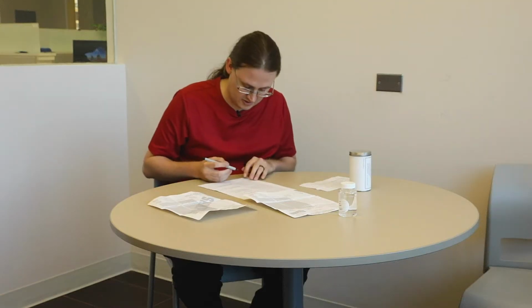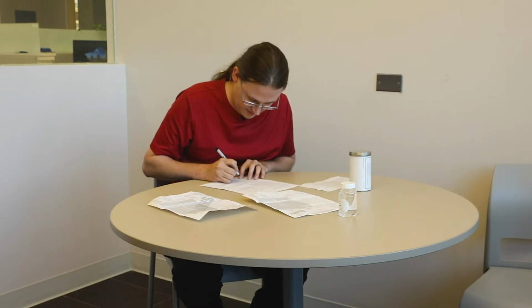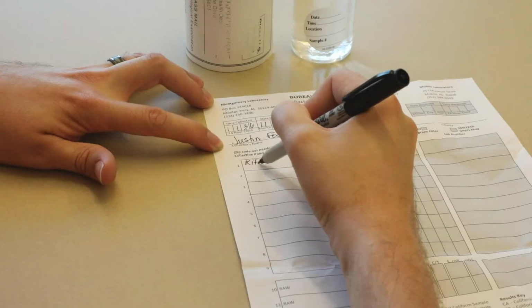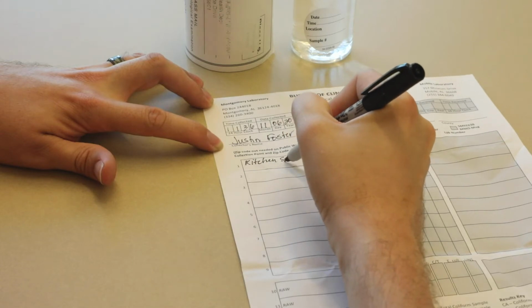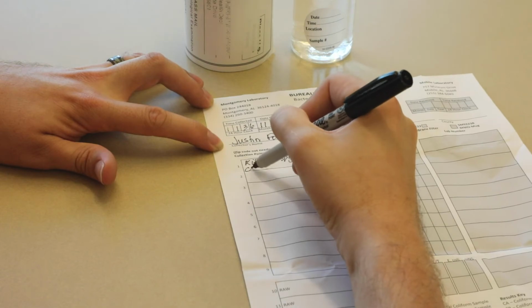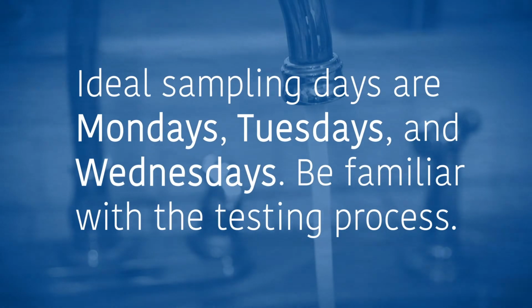Before receiving a test kit, you will want to schedule accordingly. Well water samples must be submitted no longer than 24 hours after sampling, so you will want to sample your well water on a day that the lab is receiving samples, not on a weekend. Ideally, you would like to sample on a Monday, Tuesday, or Wednesday and familiarize yourself with the test before sampling.